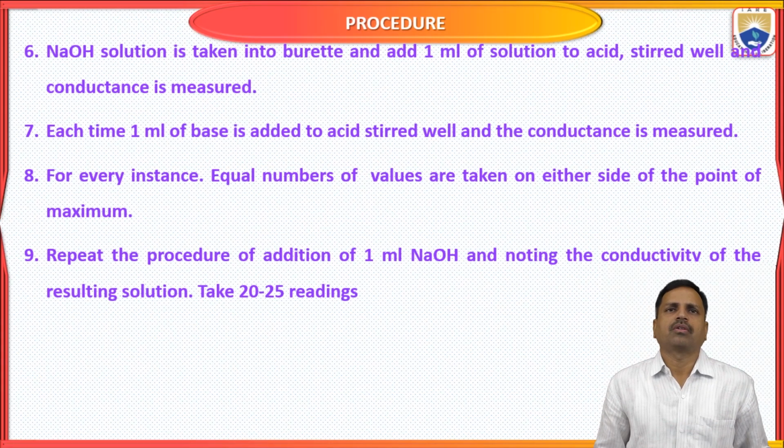And the sixth step, what do we have to do? NaOH is taken in a burette. Which NaOH do we have to take?